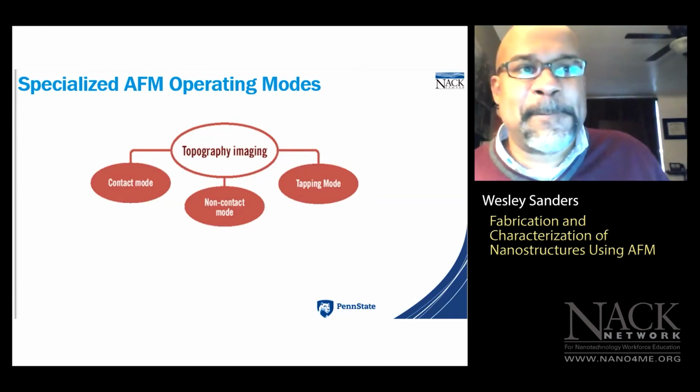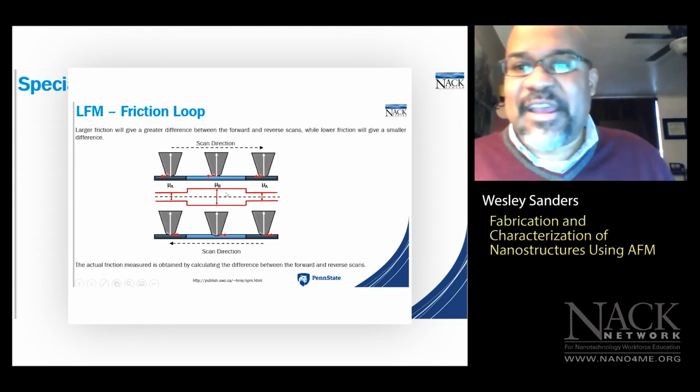If you take a point and you scrape it along one direction, are you actually changing the orientation of the molecules on the surface? And so that when you go back over it, you're going back over the same position, then you're getting a difference in friction force? Right. So yeah, let me go back. This would be a better graphic to use to answer your question.